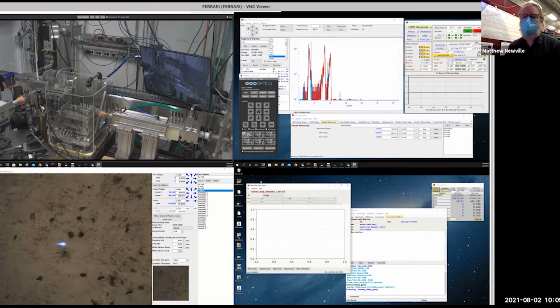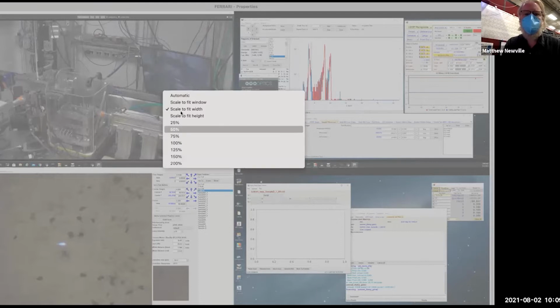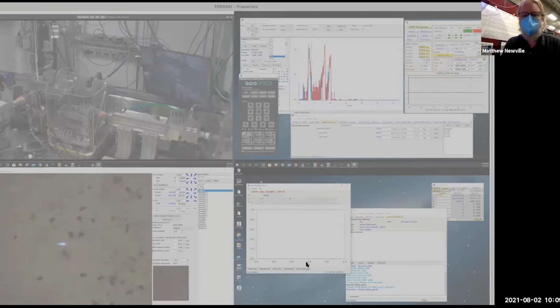So I think most of you have been to some beamline to do some kind of work. It may not have been XAFS, and it may not have been at the APS, but they're all pretty much the same, really. So I'll say that this is approximately a normal beamline, at least for the APS. So I'm going to change my view here to be a larger view and then zoom in a bit.